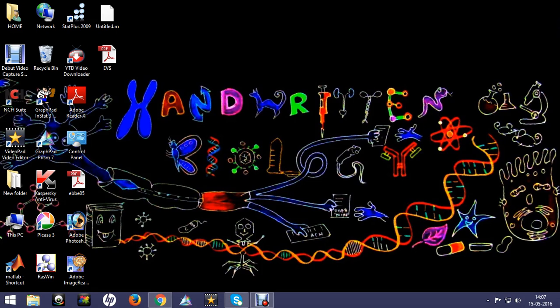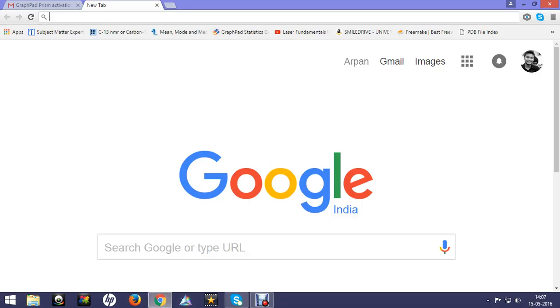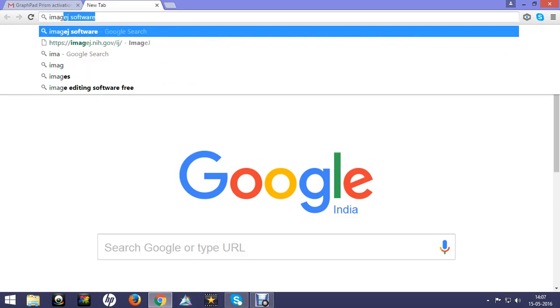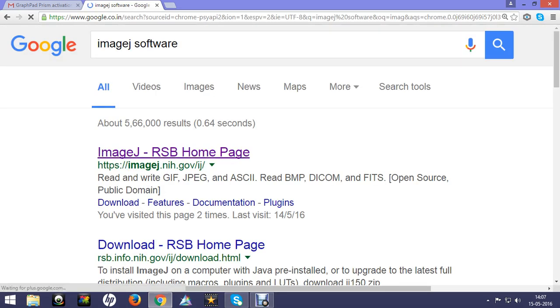We can also analyze radiological data. To download ImageJ, first go to your web browser, go to the search bar and type ImageJ. Then click on the ImageJ result.